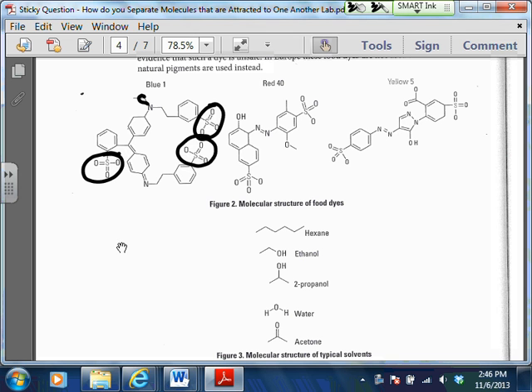The yellow, we've got a couple of the SO3 groups, we've got hydrogen bonding, and then we've got this carboxylic acid group right here that, again, you might not have necessarily known about, okay? We've got another couple of places right here where hydrogen bonding can occur. So there's a lot going on in this molecule that would tell us that this one probably can go fairly far as well. Okay, the red went the least far out of all of them, okay?